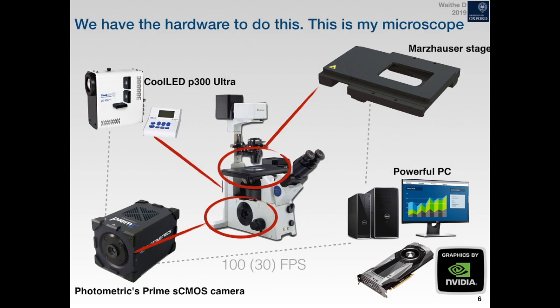And then attached to all of this, we have a control system. And in the case of the algorithms I'm using, we have a GPU where we actually run the algorithms. Okay, so this is the equipment that we bought for the project, and I constructed a microscope. You see, I also played around with some of the optics, and we'll talk about that later.